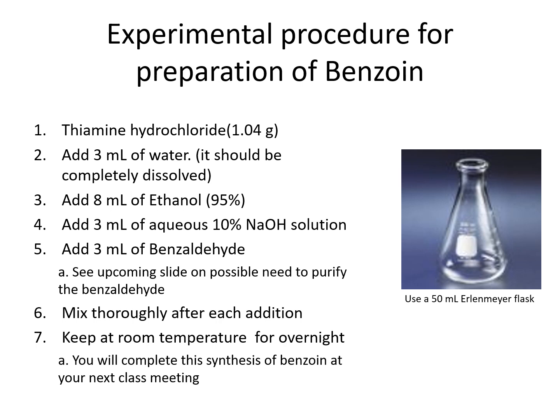So certainly we're not going to get the product immediately as in the other experiments. For this one we're going to let it react overnight, and we can get our product the next day.